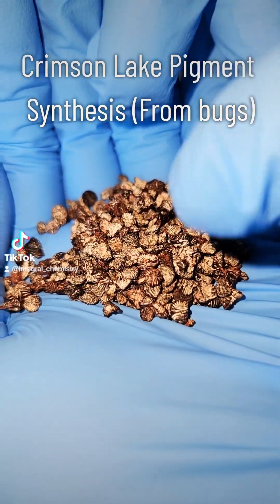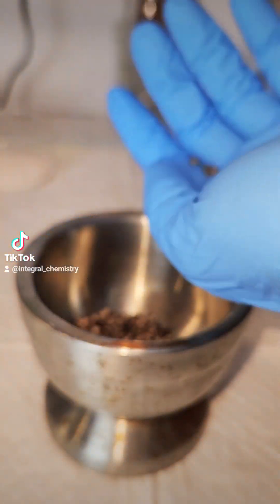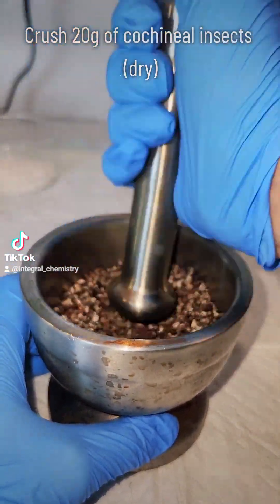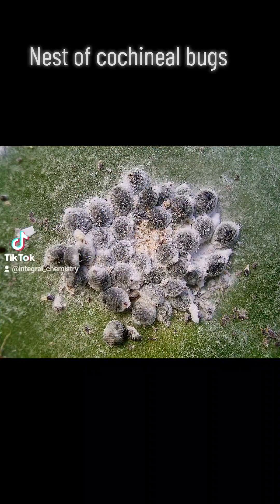Today I'm going to make a crimson lake pigment from an insect called cochineal. What I have here are their dead and completely dried out bodies, and they're that way because I had to order them online. Cochineal are a type of parasitic scaled insect that only live in the desert, and since I'm not in a desert I had to get them this way.